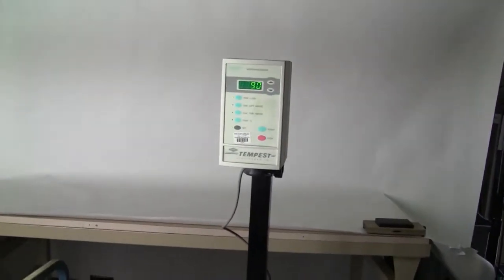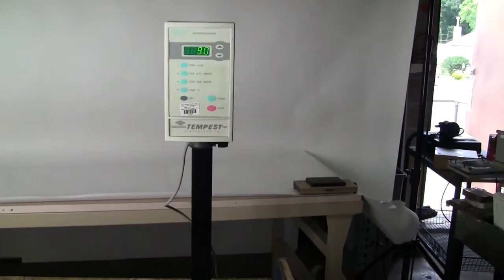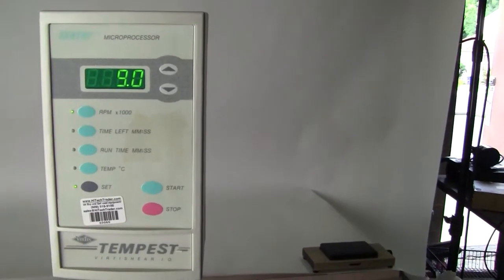Hi, this is Jim from HitechTrader. Today we're looking at a VirTis Tempest VirTishear IQ homogenizer. It has a top speed of 32,000 RPMs and a fully programmable processor.